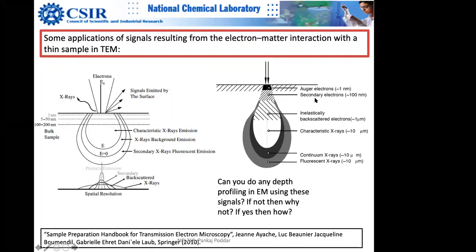But electrons do not, they are very interactive, okay? So they will not be able to escape from the deeper levels of your thick sample. You can only pick up a few nanometers. Depends upon the energy, okay? It depends upon the energy.